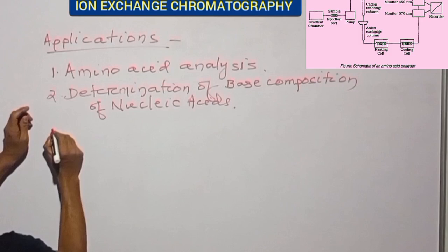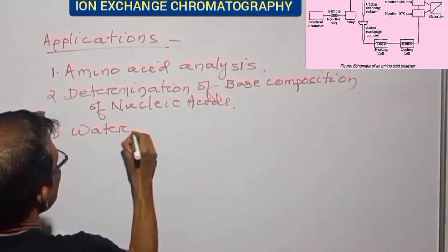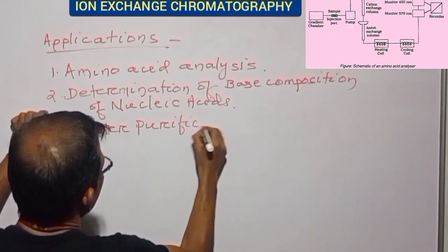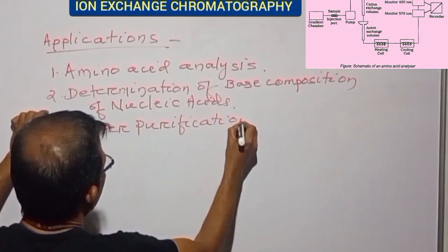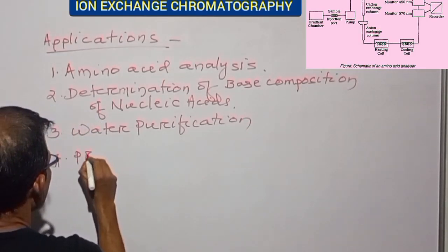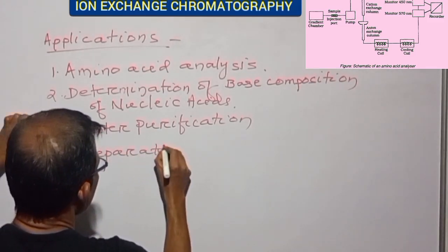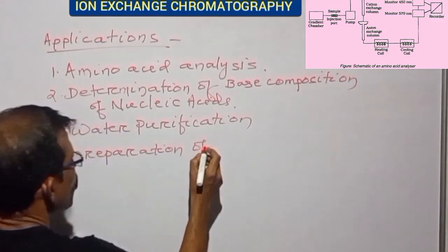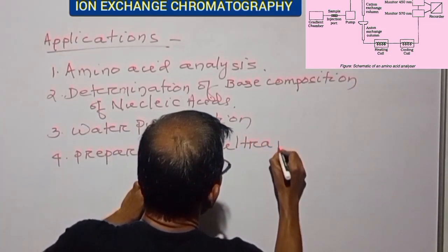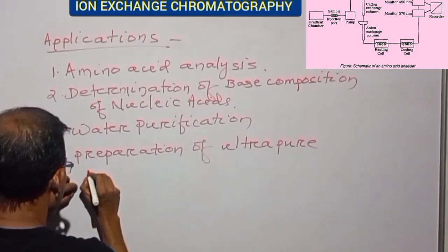Next one is water purification and preparation of ultra pure metal ion free reagent.